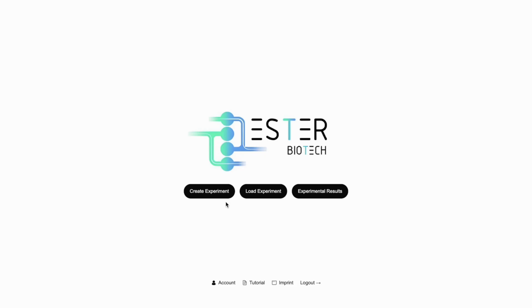This program is about creating and planning your plate-based assay experiments and organizing your data. So let's start right away with a quick example.